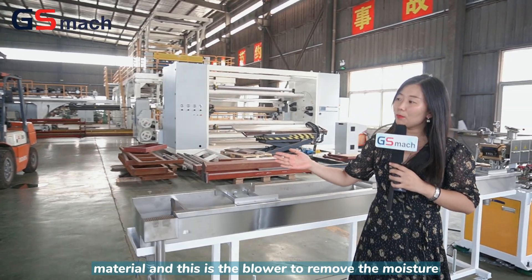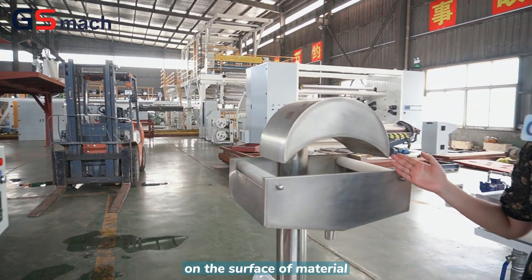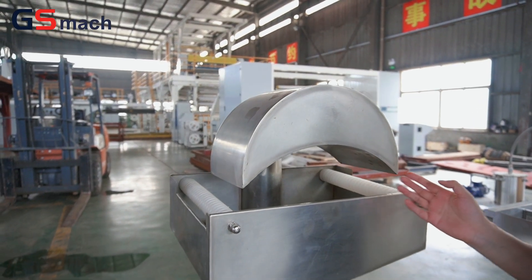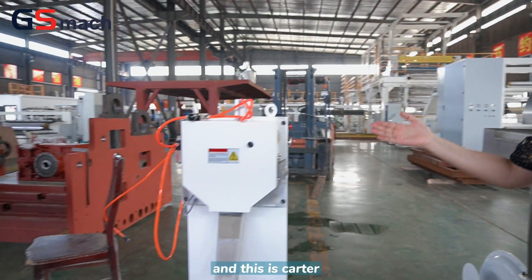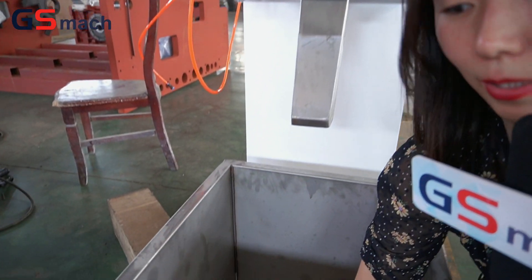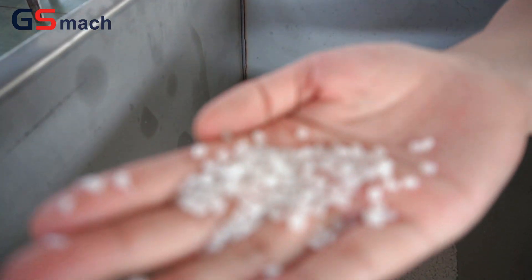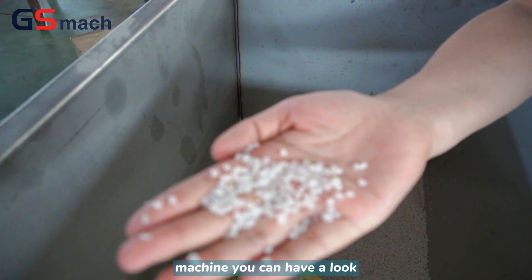This is the air blower to remove the moisture from the surface of the material. And this is the cutter. We ran the machine this morning and tested the materials — you can have a look.